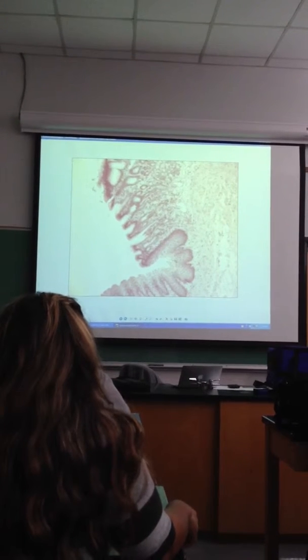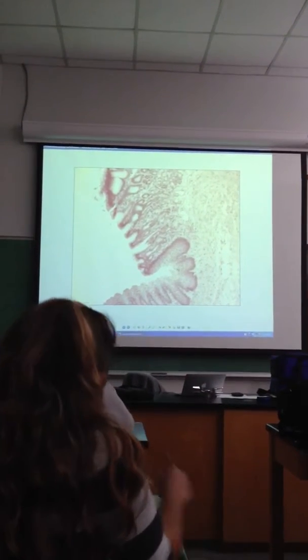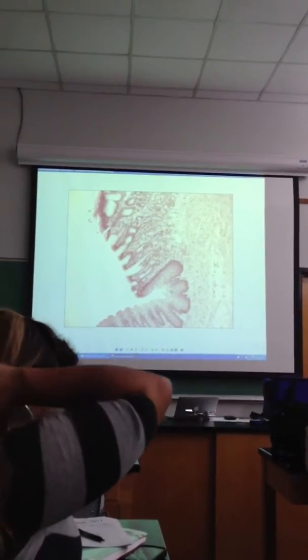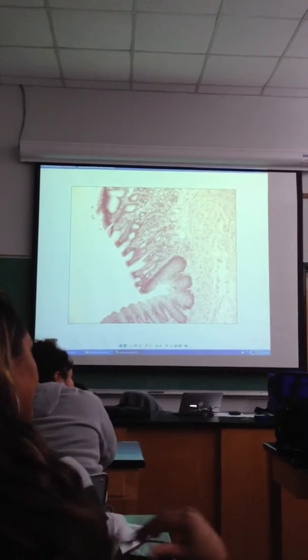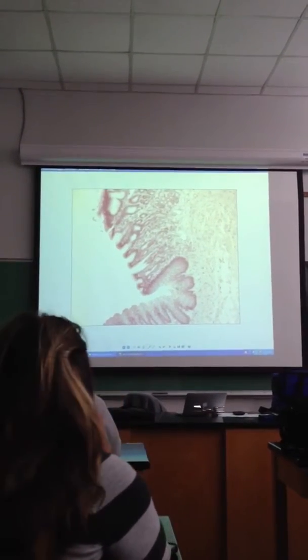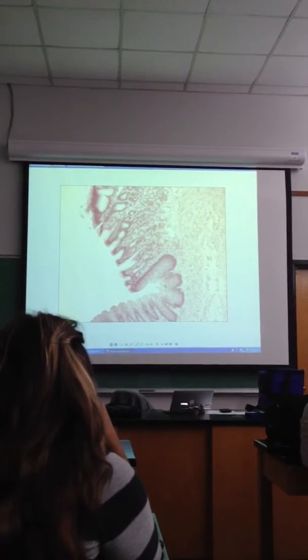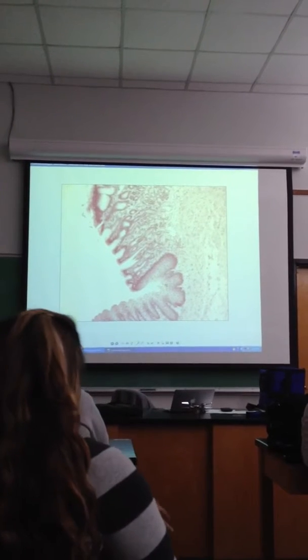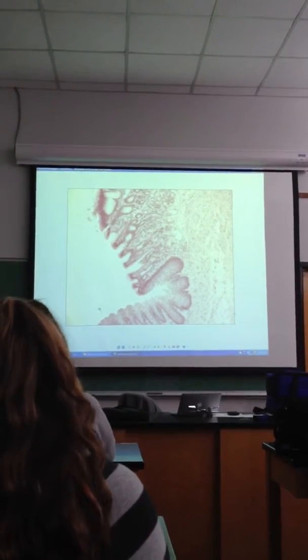The stomach is marked, at least you can't really see it here, by simple columnar epithelium. Those little depressions that you see in the surface of the stomach are called gastric pits. Also fairly distinctive of the stomach. So, gastroesophageal junction: esophagus more inferior, stomach more superior. Where are the pits, you said? The indentations that are throughout.